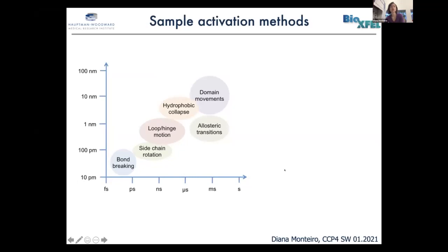And what you want to do is to make sure that you're triggering your sample and synchronizing it quickly enough that you can see the transition that you want to see. Unsurprisingly, the easiest way to do this is to go after a protein that is naturally photoactivatable, because that means that it will actually react to light. So you can shine light on it, and these processes are usually really fast, and then just let it run and probe it at a different time.